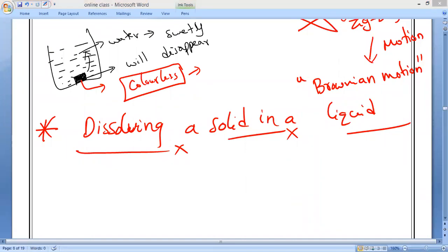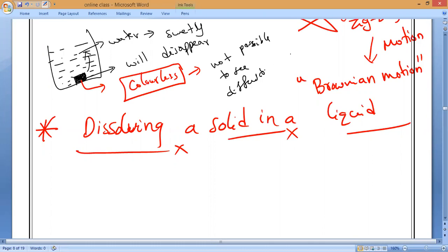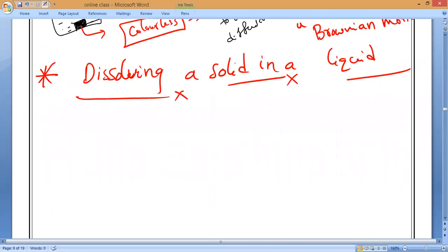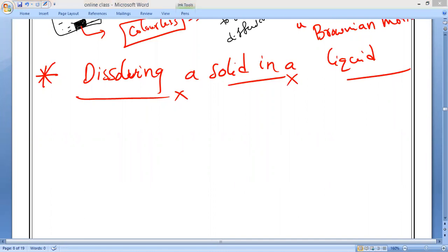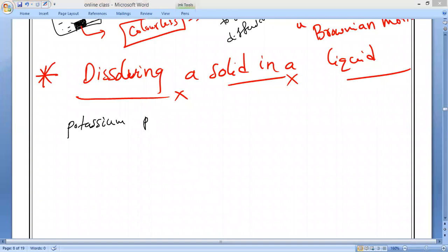We cannot see the diffusion of sugar because it is a colorless substance, so it is not possible to see. That is why — can we take a colored particle so that we can easily observe? That is what we do. For dissolving a solid in a liquid, I am taking a chemical called potassium permanganate.